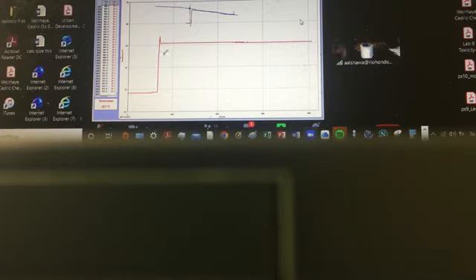All right, so where are we going with this? So I'm waiting until that temperature goes down to 26.0. It's going to take a while. So not so bad for that cheap container. This is just a few bucks, and I got that container with the least amount of expenses. But look at the robust temperature inside of it. Yeah, it just went down from 26.2 to 26.1, and it took a while to get to that temperature, I guess. But I'd rather see it going down a little bit further.